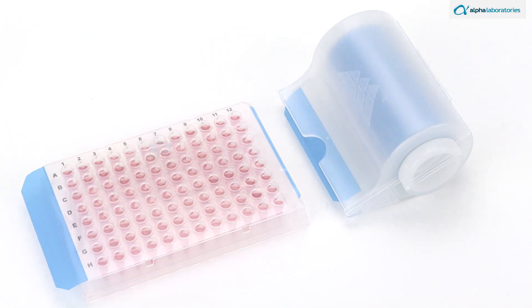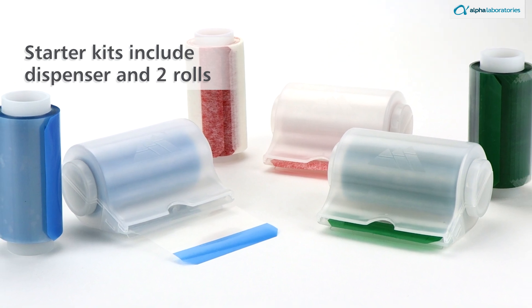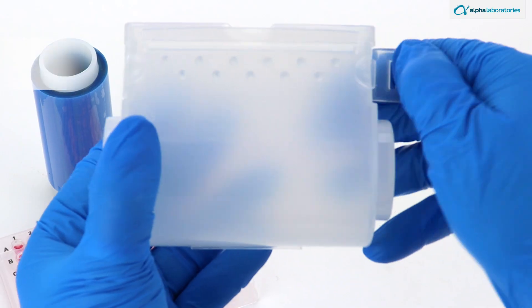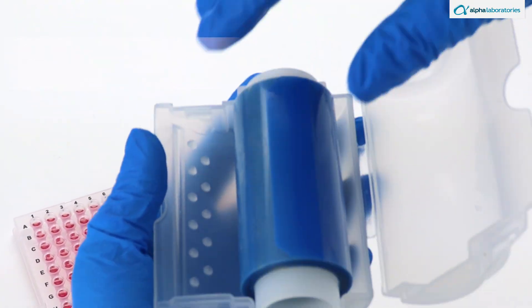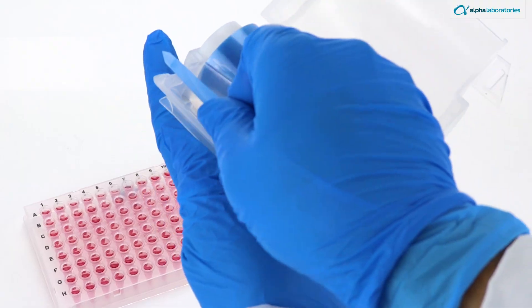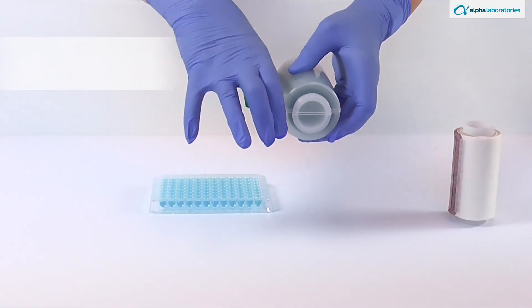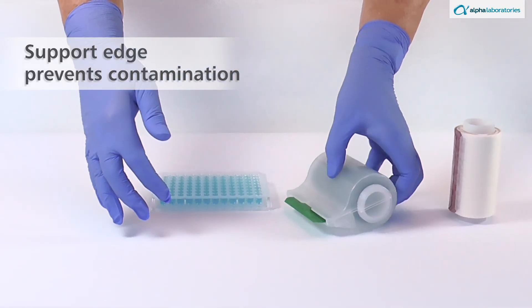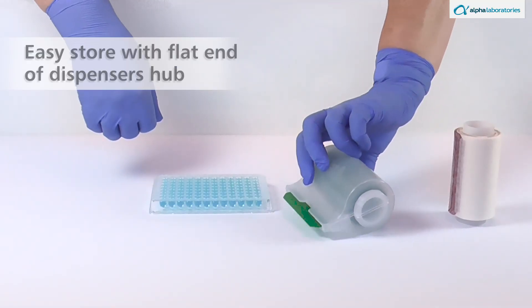The Seal Mate system starter kit includes the hinged clamshell design polypropylene dispenser and two rolls of sealing film. The Seal Mate dispenser protects film rolls before dispensing. It opens to insert a new roll of seal, and the clasp securely locks on both sides of the dispensing bill. A support edge underneath prevents the bill from touching the benchtop when not in use, preventing contamination.